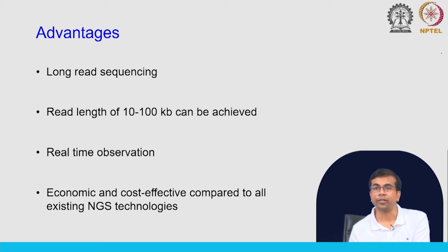Now, one of the questions you might ask: when we discuss that Illumina is probably the dominant platform today, and most sequencing happens on Illumina, why do we not shift to nanopore sequencing? Why are we not doing sequencing in the nanopore? Because it is really great. We have long reads, we have low cost, etc. Everything is in favor of this method. So why are we not switching?